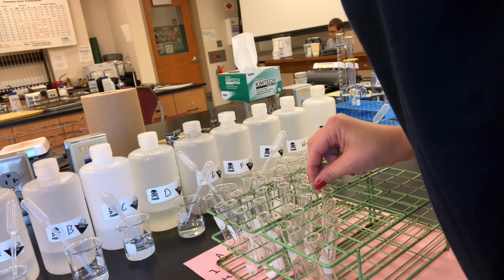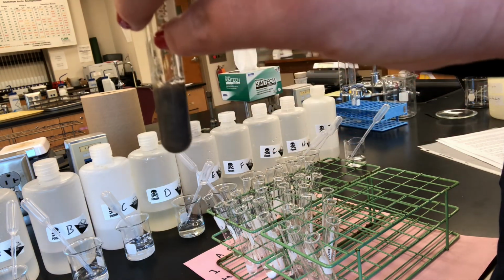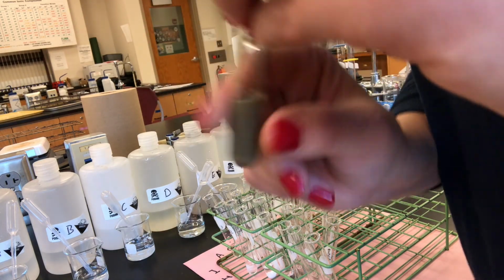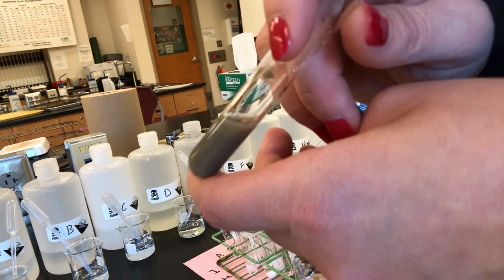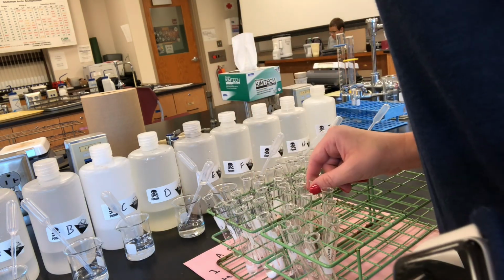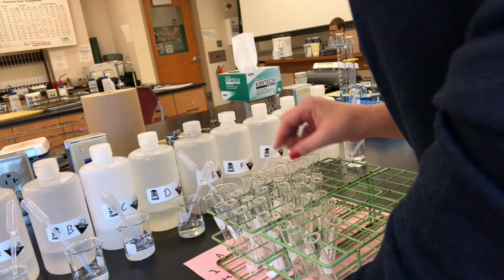All right, E and F. We got E. I'm adding F. Oh, there we go. Look at that. Definitely got a nice dark brown. I wanted to say chocolate milk, but that would look like disgusting chocolate milk. We got a brown precipitate formed.